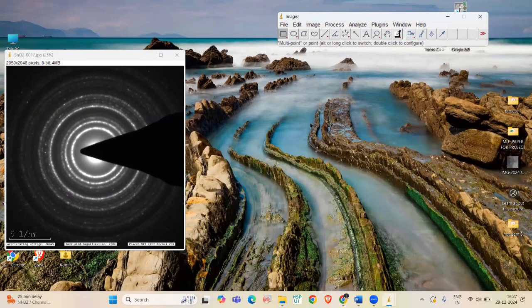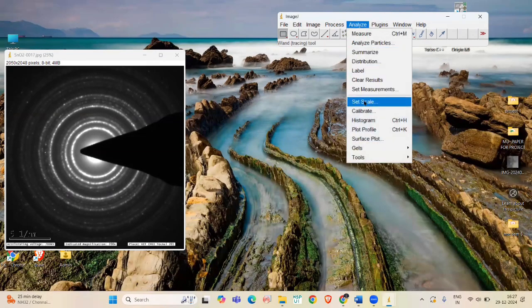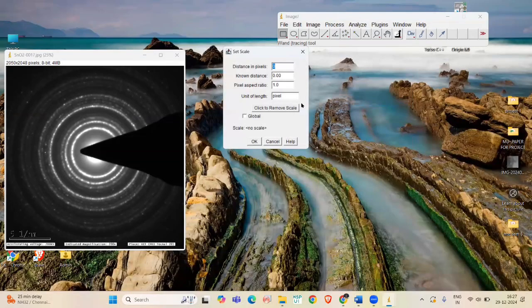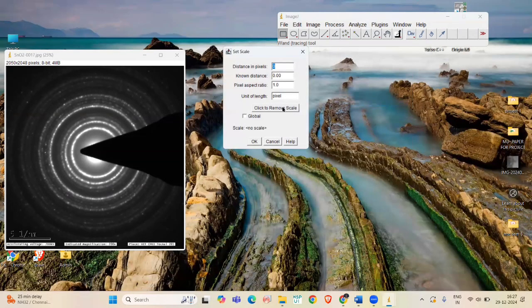Next, go to Analyze and select Set Scale and select Click to remove scale to clear any existing scale.